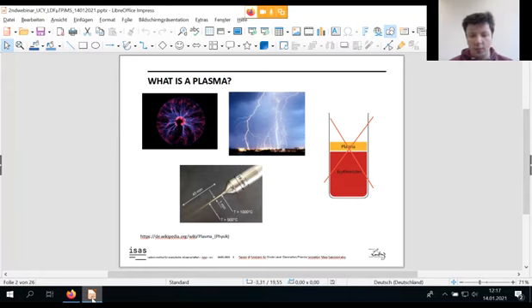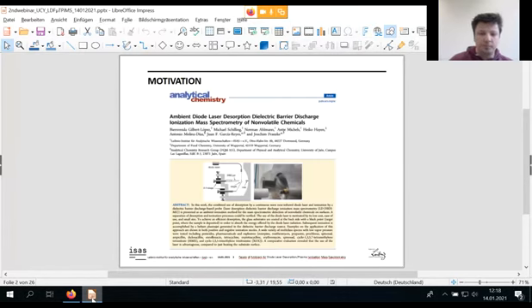There are, of course, other plasmas, very thermal plasmas, or even lightning, which is more or less a plasma, but in a very strict technical sense there are even some differences and deviations in that, but I don't want to bother you with the details. Here it is just to take home that we are using non-thermal plasma, which you can also apply to your skin, for instance, because the gas temperature is low. That's the key element. So we're talking about ionized gas in the end.